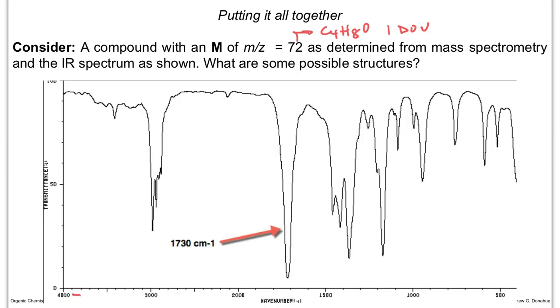This is an IR spectrum. I would hope that we all can agree on this, even in these turbulent times. This spectrum looks nothing like a mass spectrum. So that's part of the recognition here: when you see a piece of data, know where it's coming from.